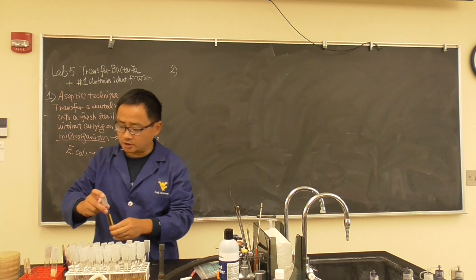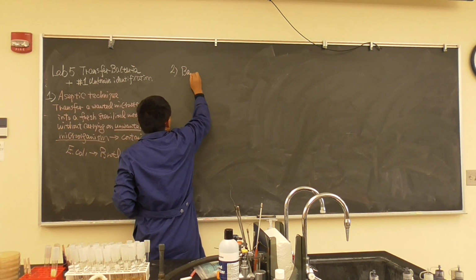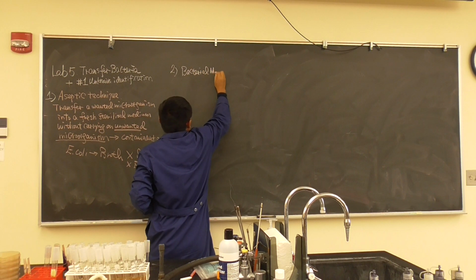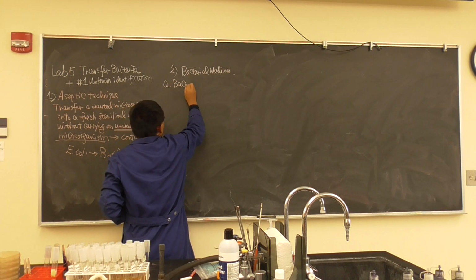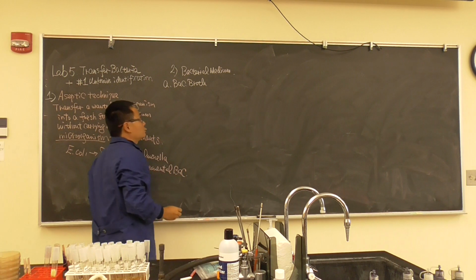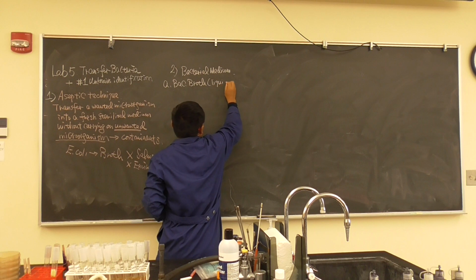This is a broth. So we talk about a bacteria medium. So number one is bacterial broth. This is a liquid medium. Okay, obviously you know that.